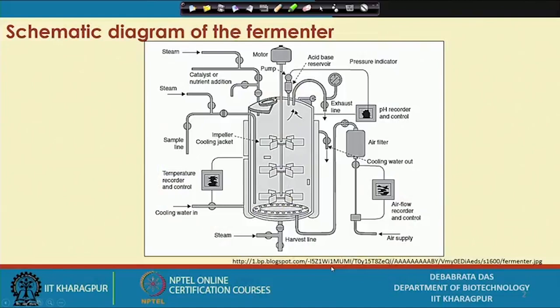Now, this is regarding application of that, because when we apply it in the fermenter, how the industrial process is in operation. So this will give you the information on how the industrial fermenter is operated, and how we can do the material analysis. So I hope this particular lecture will be very useful for you. And first, let me start with the schematic diagram of the fermenter.